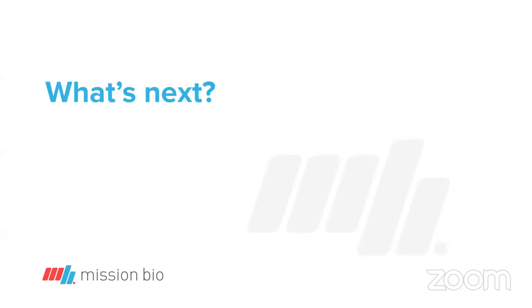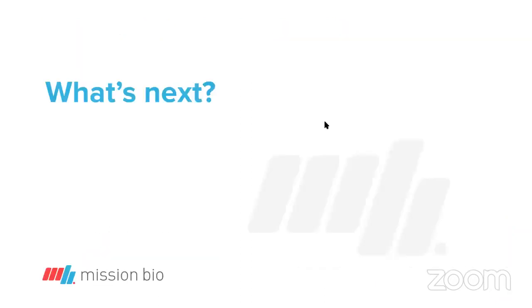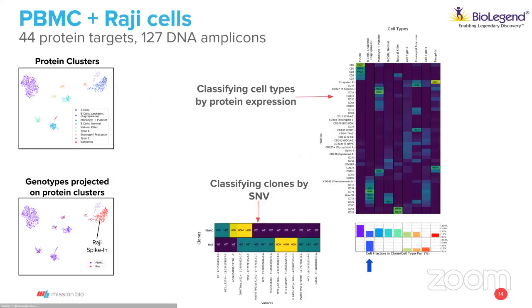So what's next? So far, I think I've shown internally 16 protein markers, and I think Adam Bate's group, Ben DeMarie and Cyril Deli, did 23. Another big question I usually get is how high can you go? We are currently still adding to that panel size, but I can show you some preliminary data. This is done in collaboration with BioLegend. I want to give a shout out to David Green, who actually performed this experiment based on my protocol.